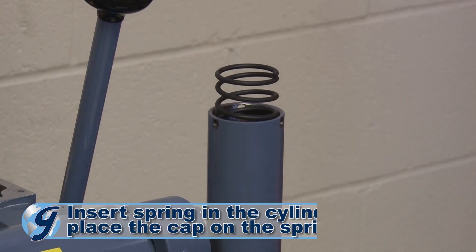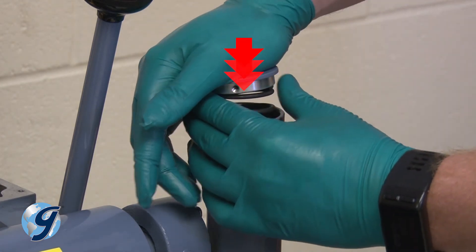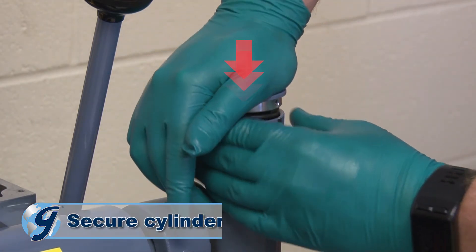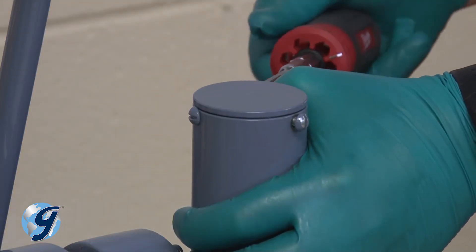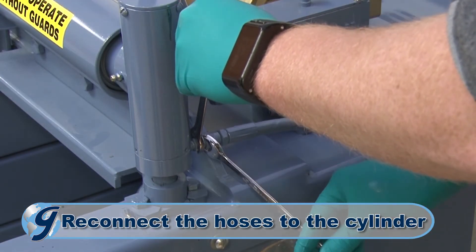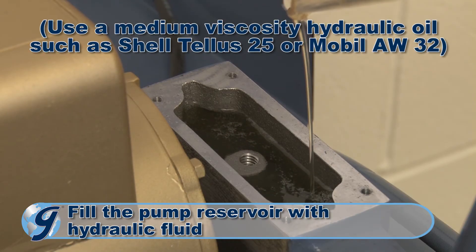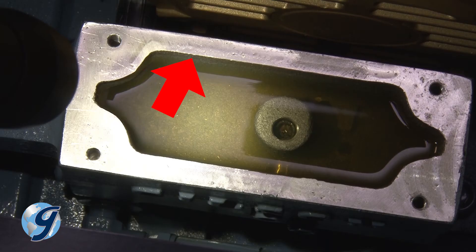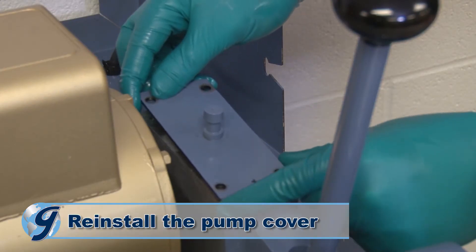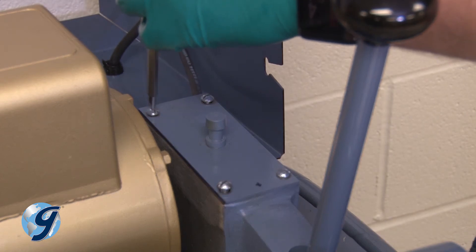Now, insert the cylinder spring and place the cap on the spring. Apply downward pressure on the cap as you secure the three cylinder cap screws to the cylinder. Next, reattach the hydraulic hoses. Fill the pump reservoir with hydraulic fluid to within a quarter inch from the top. Once you have confirmed the hydraulic oil is a quarter inch from the top of the oil reservoir, reinstall the pump cover assembly in the same orientation as it was before its removal.